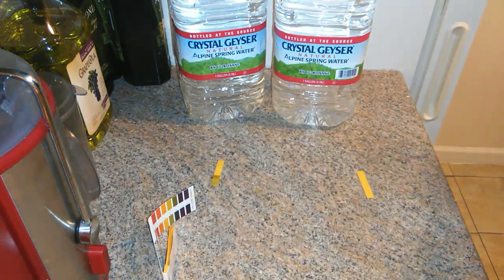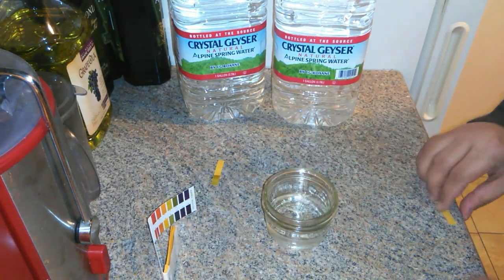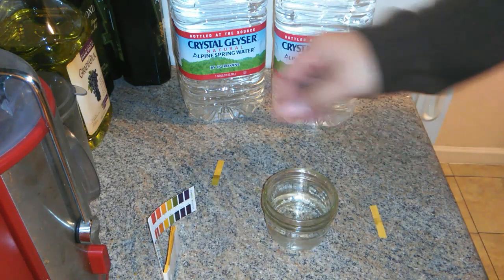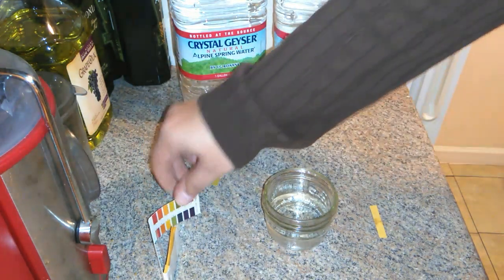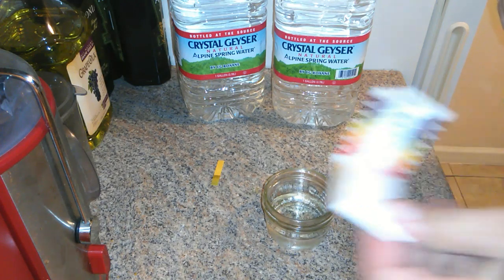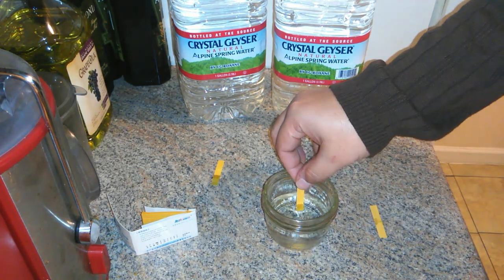Now I want to dump this out and just try regular tap water. Let's see what the tap water looks like. I got my hands kind of wet so I'm going to get another strip and pull off one more strip. Tap water.